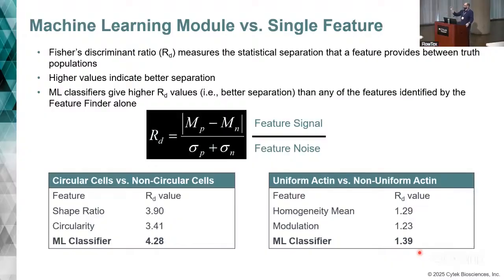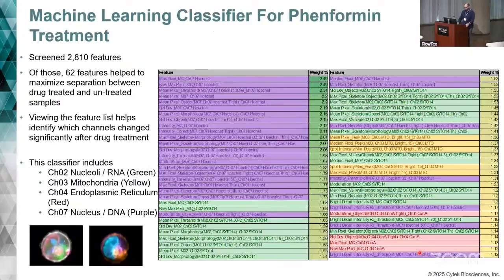That little bit of shift. We talk about resolution all the time and seeing things from background, and sometimes just that tiniest little bit of shift can make a population more clear. So how does this apply then to the cell painting?